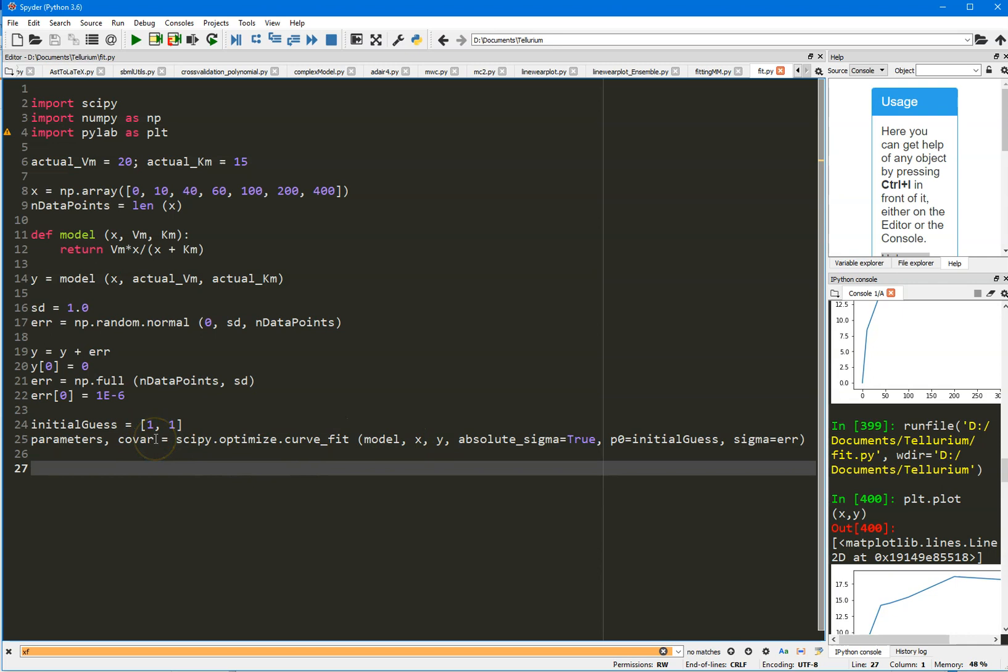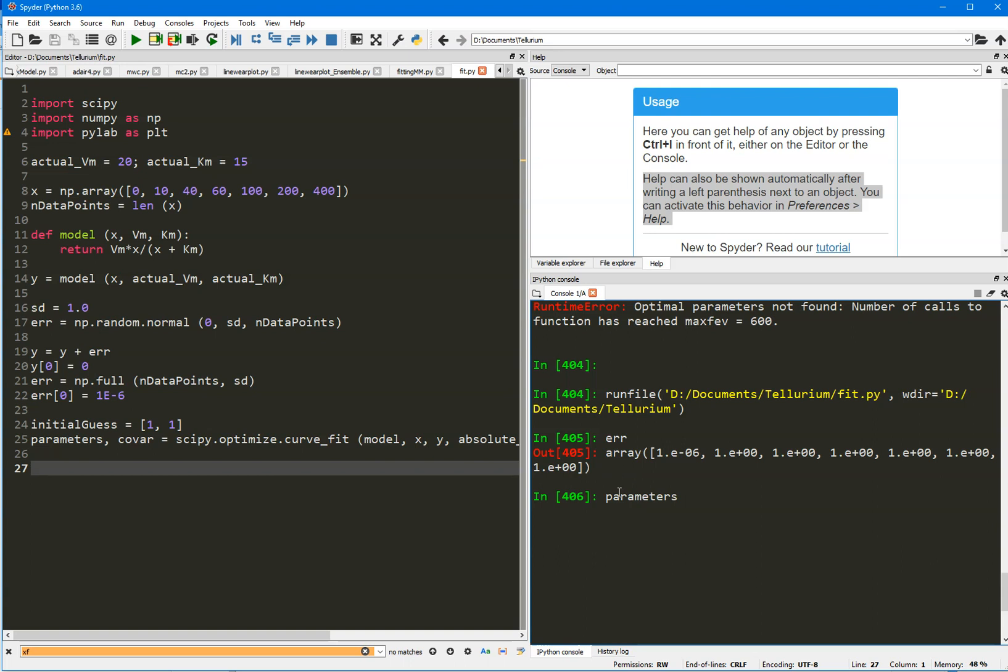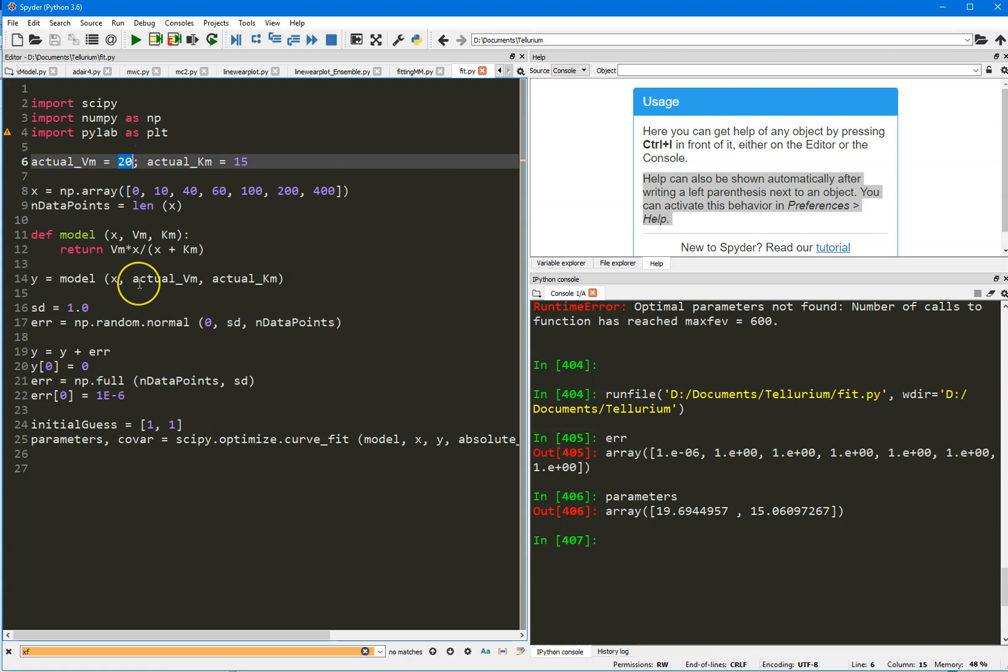The final thing is what does this function return? It returns a couple of things. It'll return the fitted parameters and something called the covariance matrix. I'll come back to the covariance matrix in a minute. I ran this, so it came back without any complaints. So if I look at parameters, those are my fitted parameters. 19.69 and 15.06. So that's the Vmax at 19.69 and the KM is 15.06. Recall that the actual values for this fictitious enzyme was 20 for the Vmax, so that's pretty close, at 19.69. And the actual KM was 15, and that's very close to the 15.06.